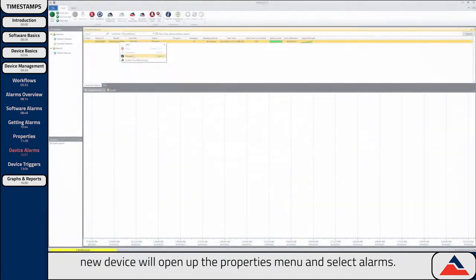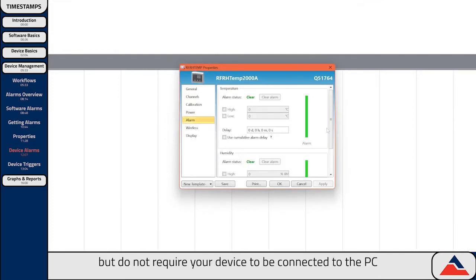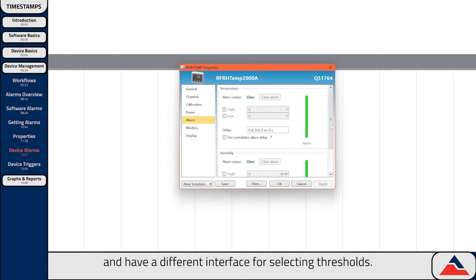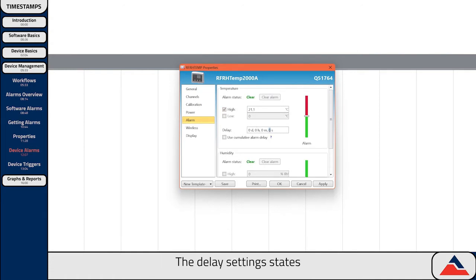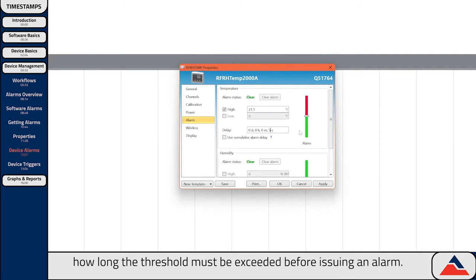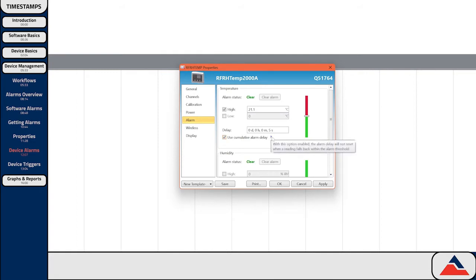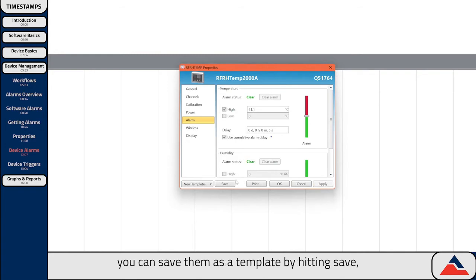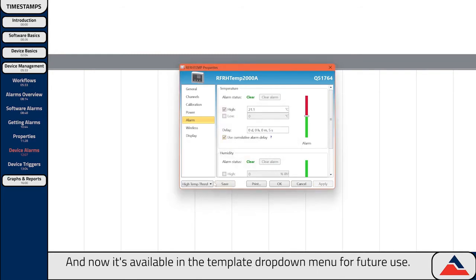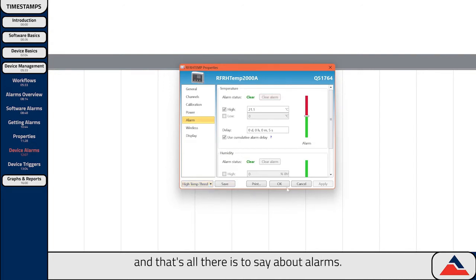Now that we've connected our new device, we'll open up the properties menu and select Alarms. Device alarms are functionally exactly like software alarms, but do not require your device to be connected to the PC and have a different interface for selecting thresholds. To activate an alarm, simply check the box next to the high and/or low threshold and enter that threshold's value. The delay setting states how long a threshold must be exceeded before issuing an alarm. The cumulative alarm delay checkbox indicates whether the alarm delay resets after values fall back within the threshold. Once you're happy with your alarm settings, hit Apply. You can also save them as a template by hitting Save. When device alarms are triggered, the alarm logs are stored directly on the device. You can hit Clear Alarms to clear the stored alarm data.